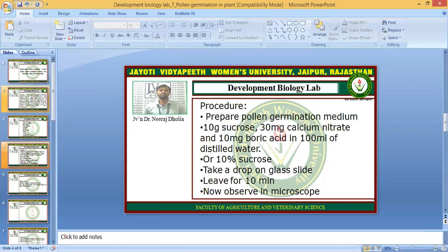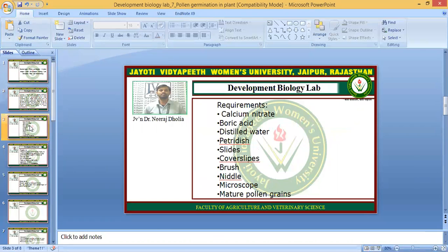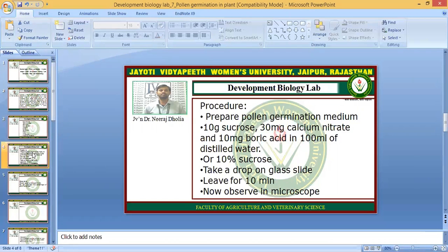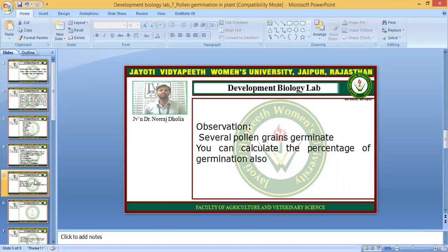Take a drop of the above solution on a glass slide and put some mature pollen grains in the drop of the solution. We will leave it for 10 minutes, and after 10 minutes of incubation, we will observe the slide under the microscope. You will observe that several — not all — but several of the pollen grains germinate, and you can see the pollen tube germination.